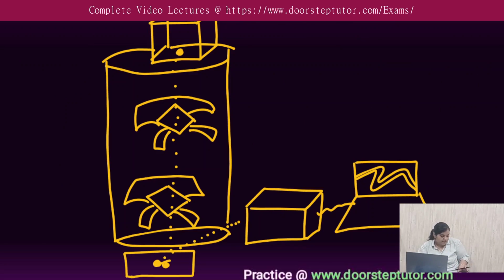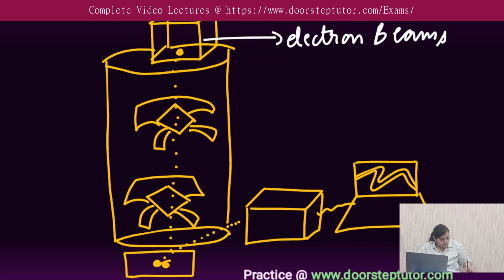This is the layman structure of it that I have drawn for you. In the above, this box represents the source of the electron beam, that is an electron gun, which is going to produce a fast beam of electrons. So this is your electron beam source. The primary electrons will be produced with the help of your electron beam source, right?